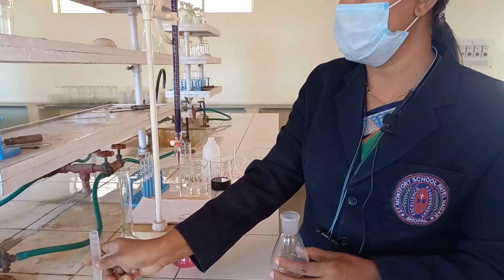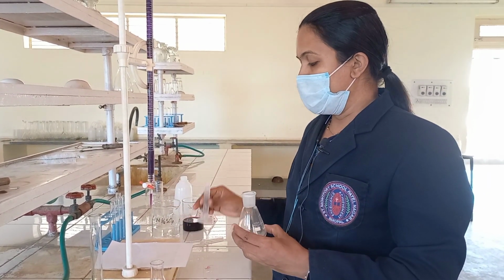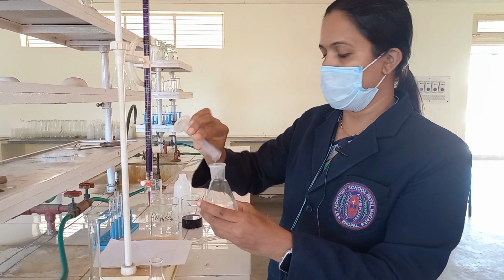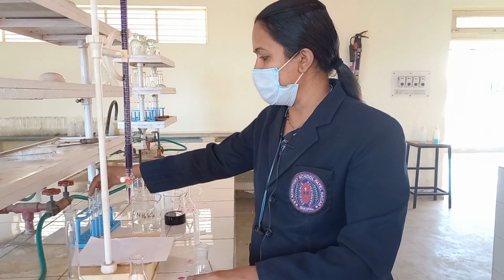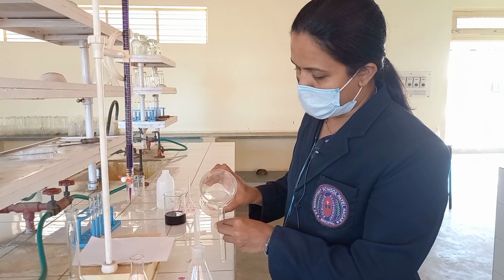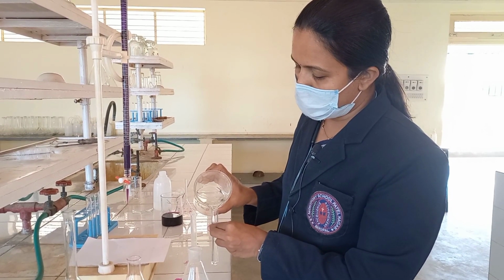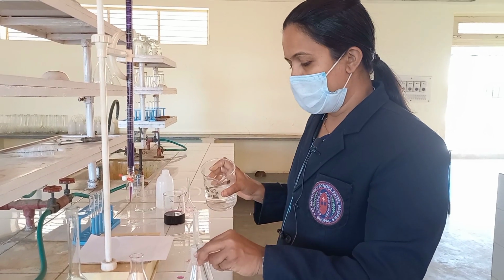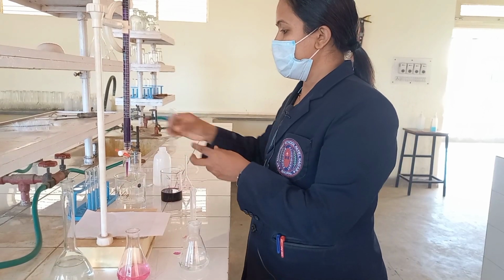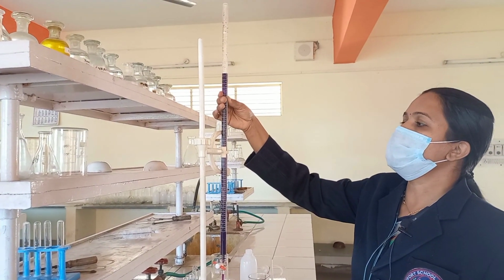As I told you, you can do this experiment with the measuring cylinder also. So I took the standard solution in the measuring cylinder and I just transferred it into the titration flask. Then again I am repeating the same procedure. Take 4N H2SO4, which will already be prepared in your laboratory. Your teacher will provide this to you. So you can add one full test tube into the titration flask. After adding this solution into the titration flask, we will do the same procedure.